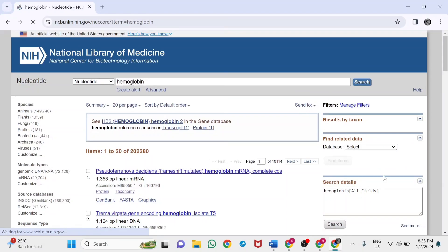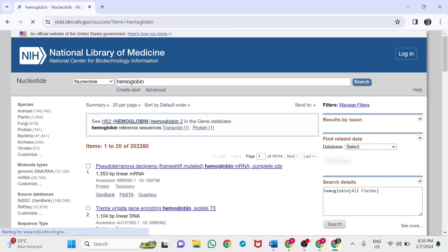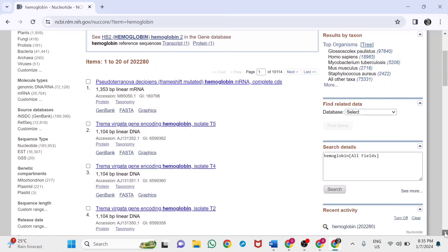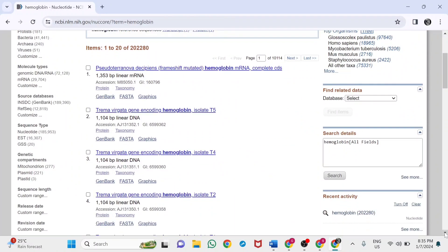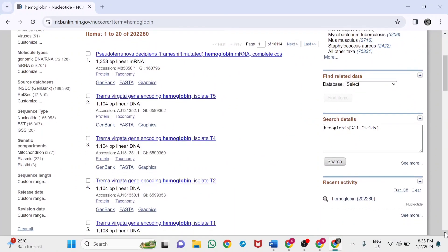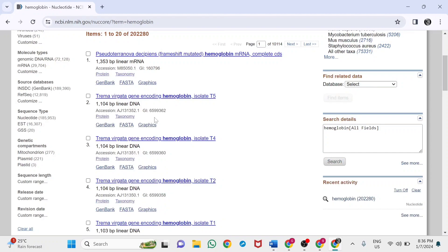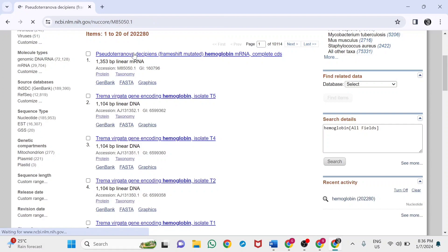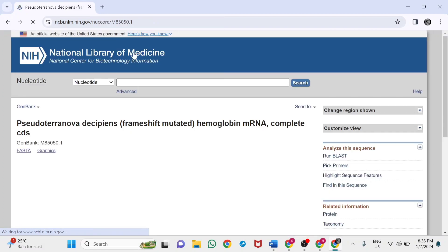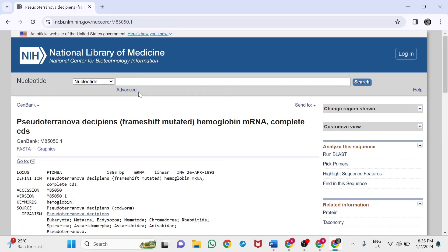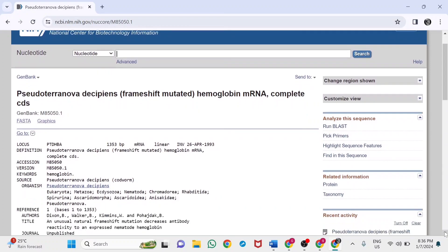The results appear here. Several documents are available based on different organisms where human hemoglobin proteins are available and their DNA sequences are transformed. I'm choosing the first one. It is a sequence of Pseudoterranova decipiens frameshift mutated hemoglobin mRNA, complete CDS.